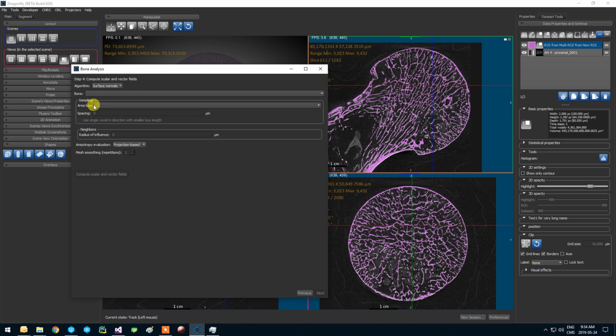The parameters are very similar for the specification of the grid and the points where this will have to be provided. I will show this in a moment. And then different parameters will have to be specified for this specific algorithm.